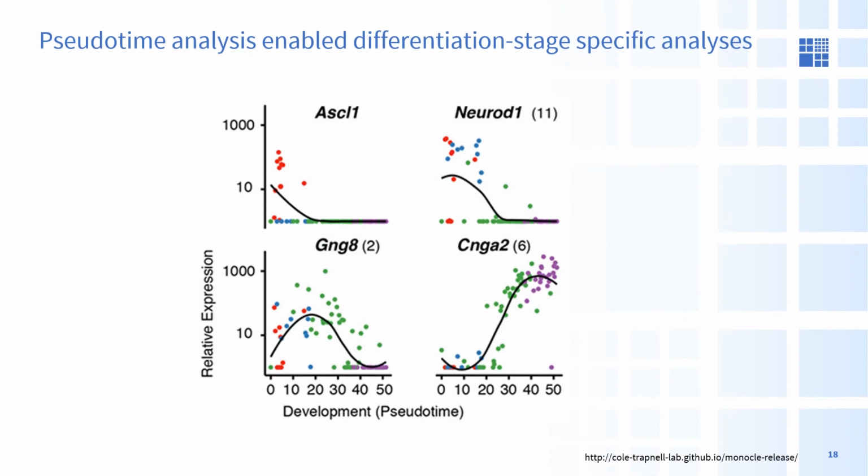Performing pseudotime analysis also allows us to produce pseudotime ranking and extract out stage-specific markers, which may have been covered up in bulk analyses. For example, a gene specific for a rare and unstable intermediate stage can now be validated in a differentiation assay.